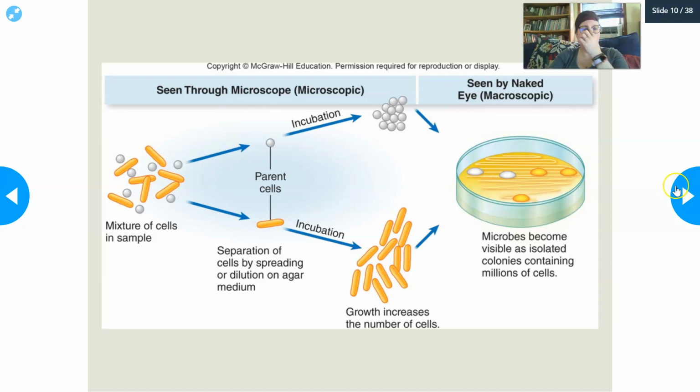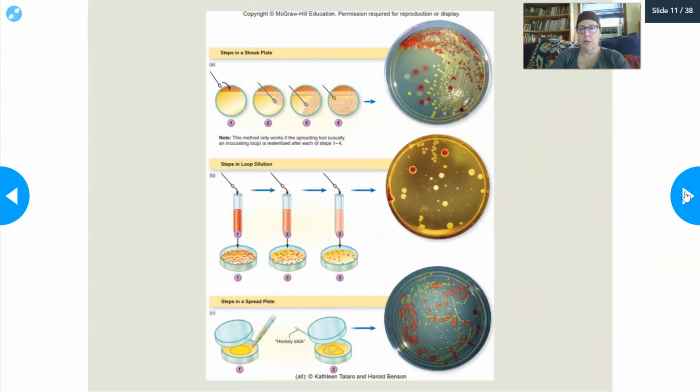Again, this is illustrated here: if you had a mixture of bacteria, as you streaked it, you can spread these bacteria out, where the parent cell of the white and the parent cell of the yellow, or the cocci and the rod here, are separated, and they each can make their own little mound, their own little colony. Hopefully you've streaked it correctly, where the mounds are separate, and you can actually identify each one and visualize them differently.